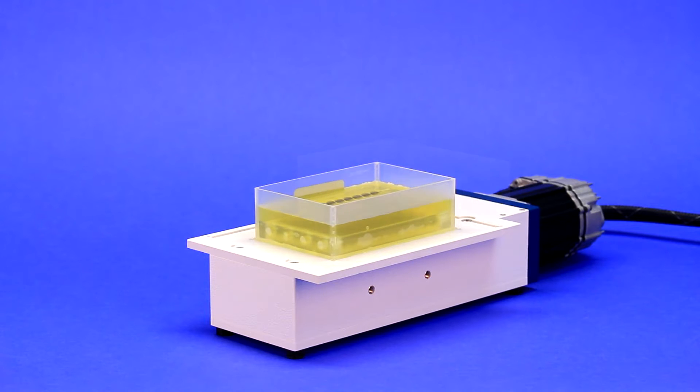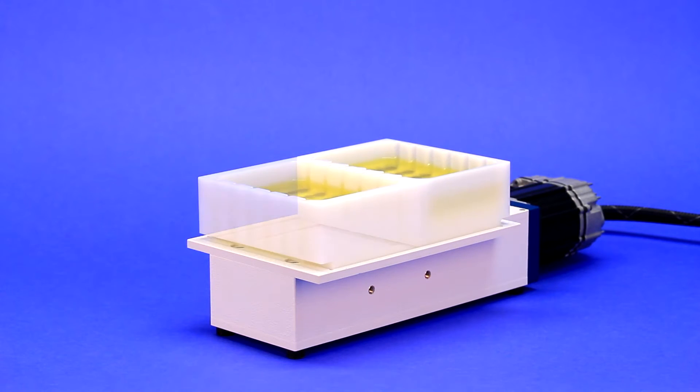Reservoirs can also be mixed on the VP710C5. We sell a variety of different reservoirs depending on the pipetter you are using.